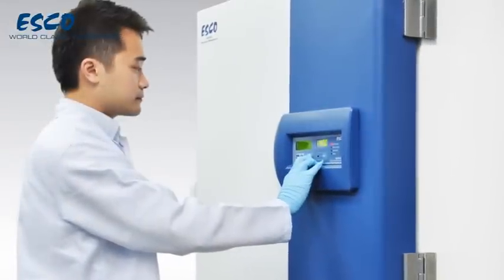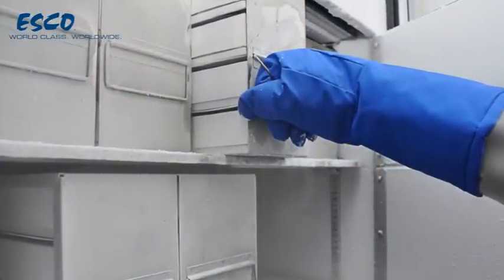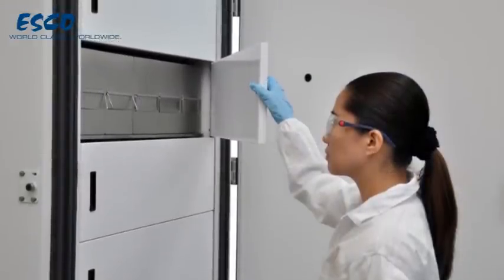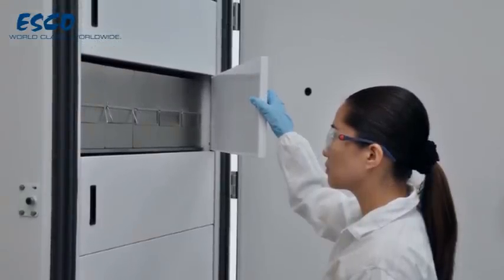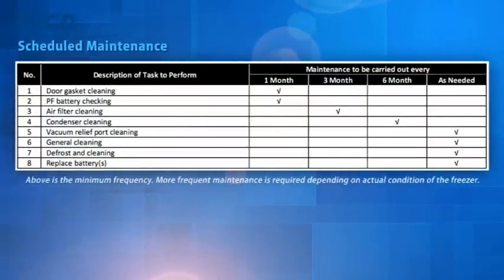Proper and timely maintenance is crucial for trouble-free functioning of any device, and your Escode ULT is no exception to this rule. We strongly recommend that you follow the maintenance schedule suggested here under in order to obtain optimal performance from your Escode ULT.